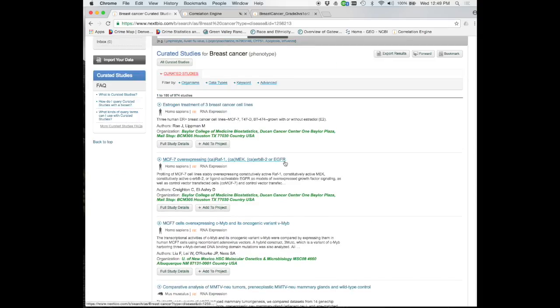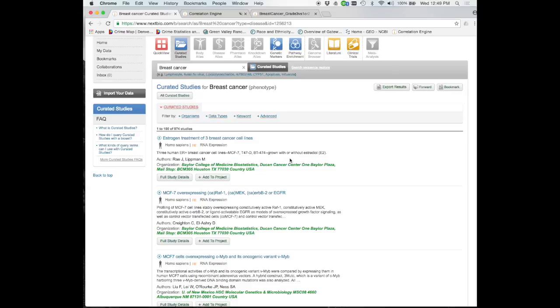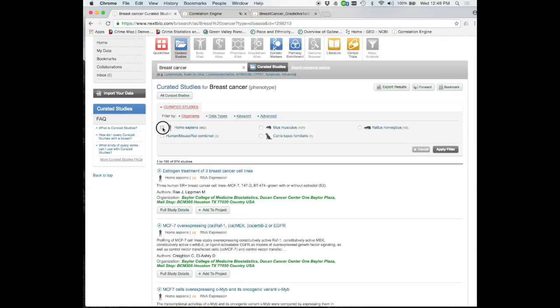Okay, so we've got breast cancer. Now we have some potential studies that we can look at. I want to filter this a bit, right? Again, I said that I'm really interested in stage 3 breast cancer. So I go to organisms here, and I can say, I only want to see people.